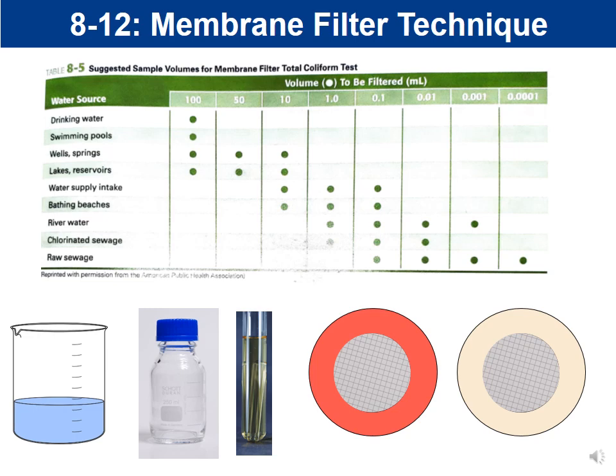And the confirmatory test, or the test that will confirm coliforms, is called multiple tube fermentation. In a minute, I'm going to talk about this, but we would start with inoculating an LTB broth, lauryl tryptose broth.